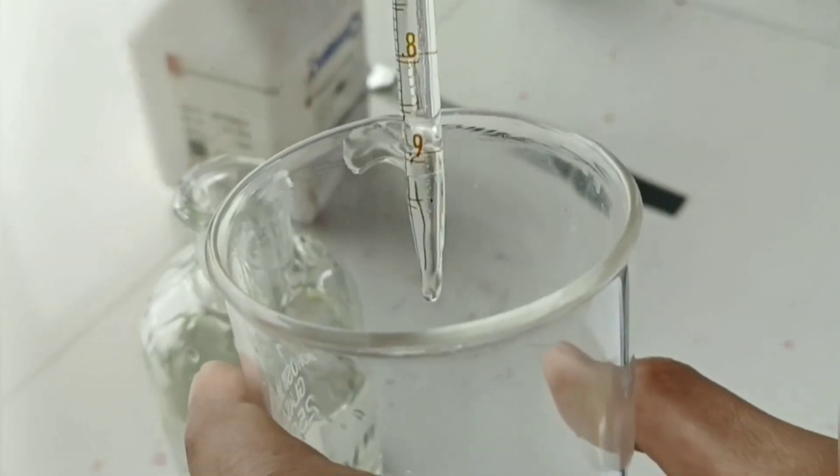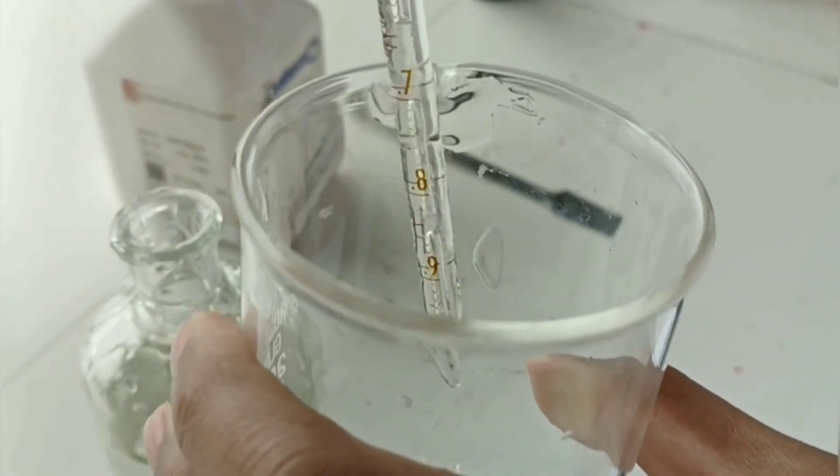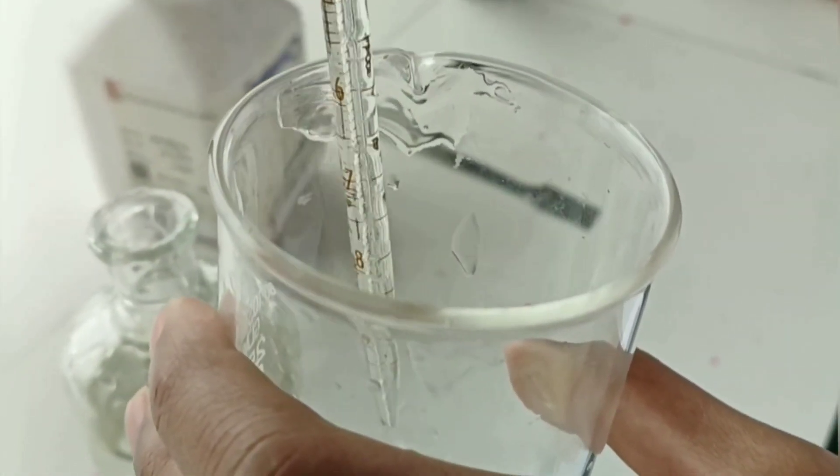First, we have to pipette out 0.2 ml of glycerin in a glass beaker. Now add 0.3 ml phenol in the glycerin.